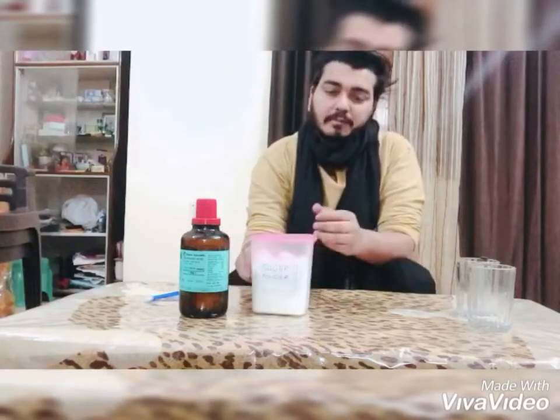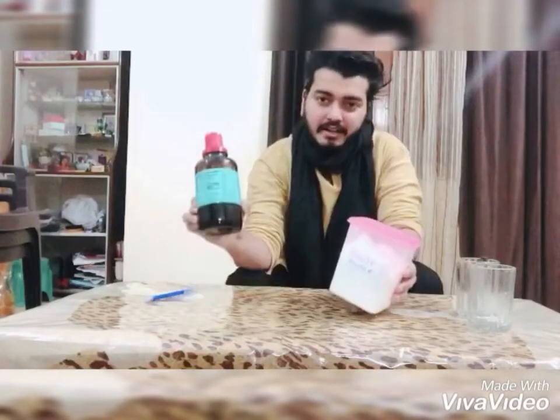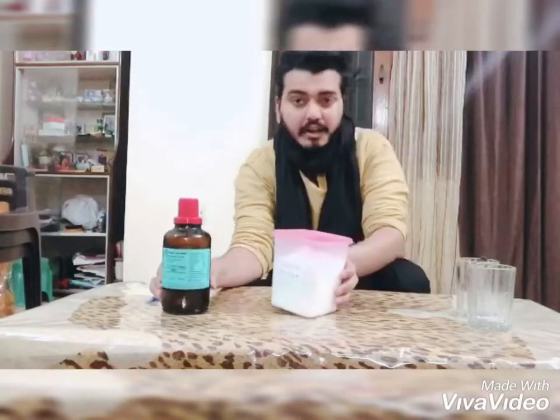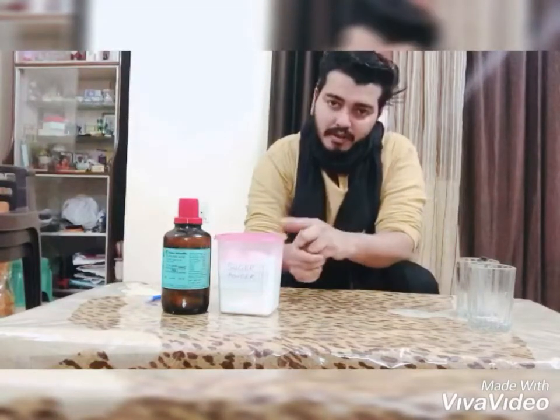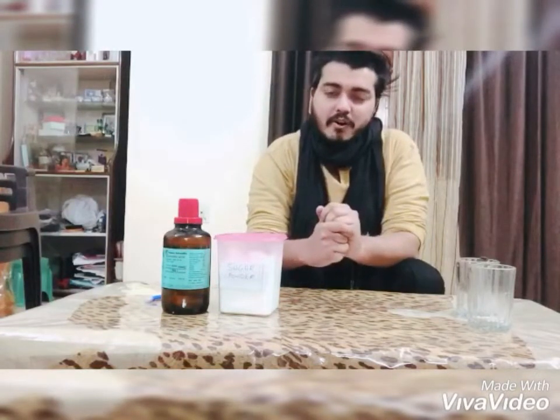For this experiment, we need a couple of things. First is sugar and second is concentrated sulfuric acid. I will perform this experiment twice — one by using sugar powder and second by using sugar crystals. This experiment is based on the dehydrating as well as oxidizing nature of concentrated sulfuric acid.